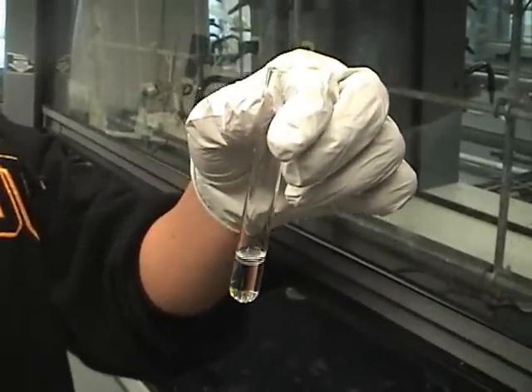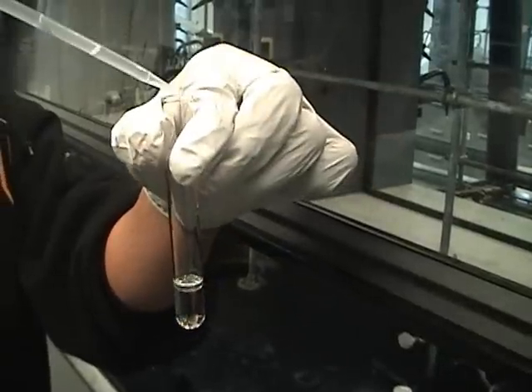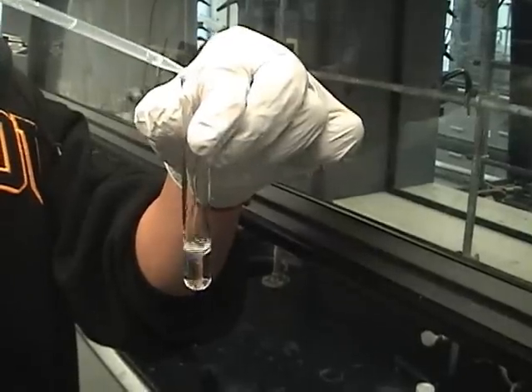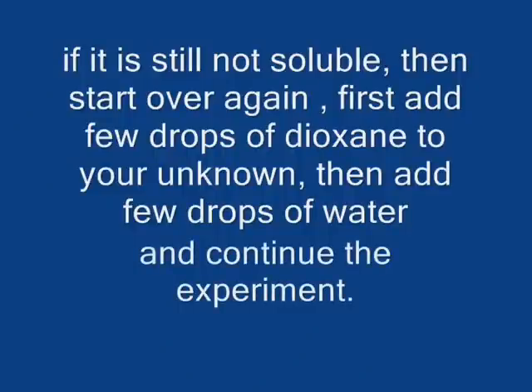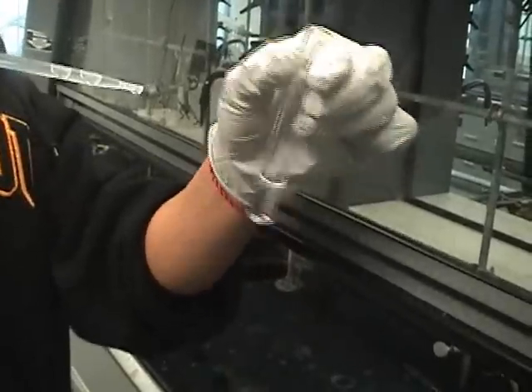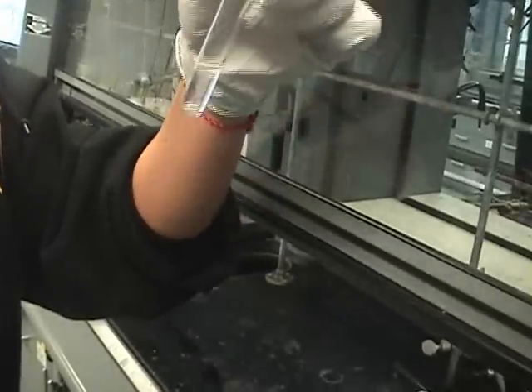Add one drop of 1,4-dioxane at a time and swirl until your unknown dissolves. It's important to go slowly and mix well to avoid using too much dioxane. If you need more than a few drops of dioxane, it's best to start over and dissolve your unknown in a minimum amount of dioxane and then add aqueous base.